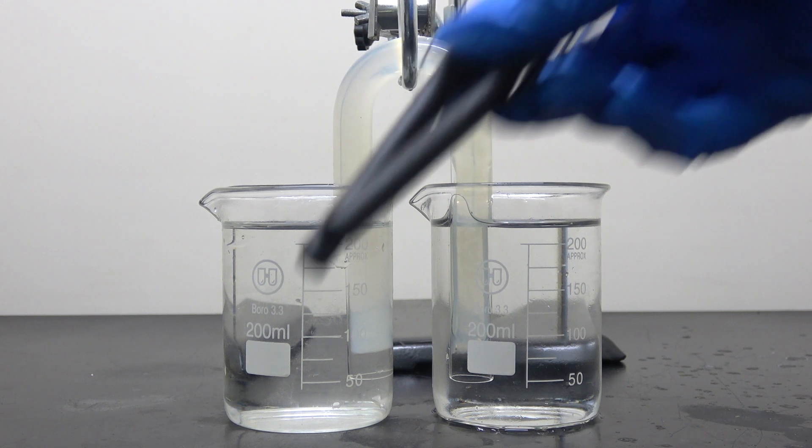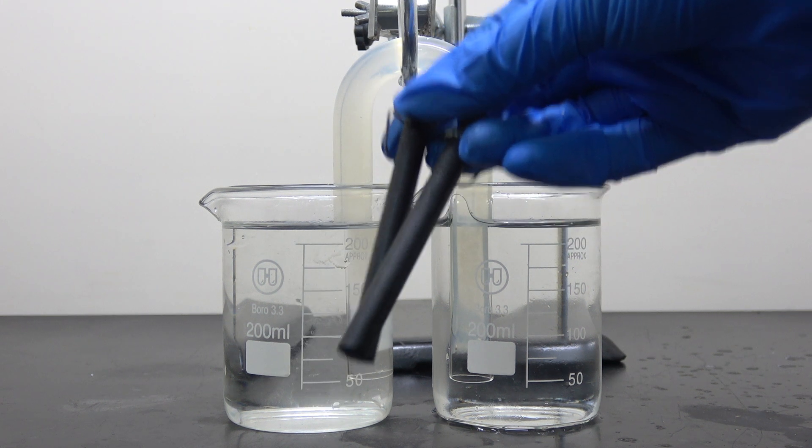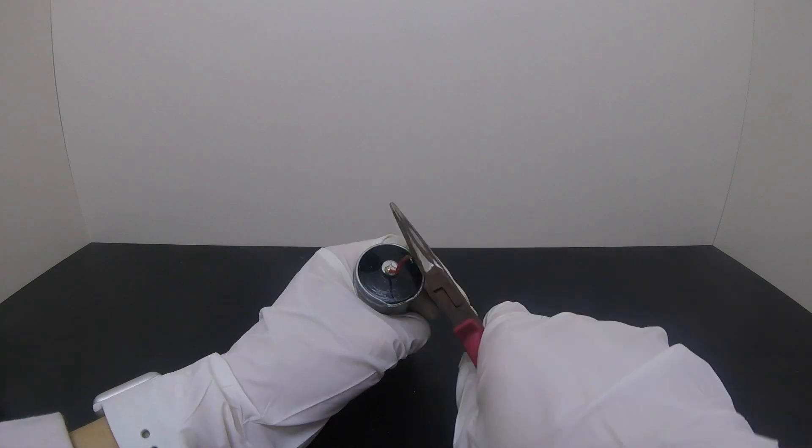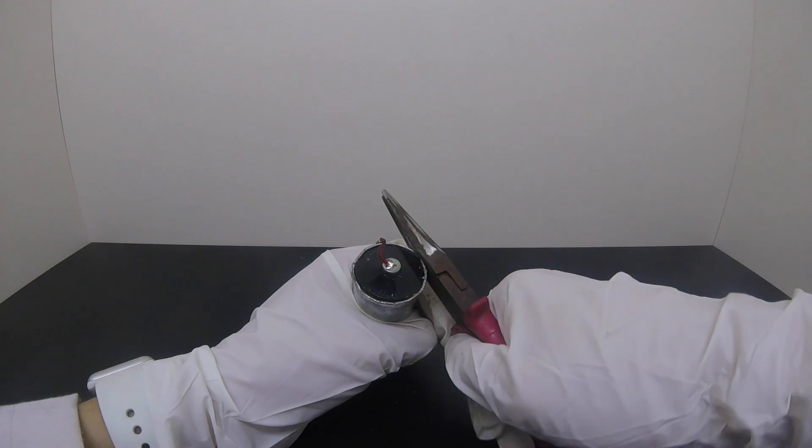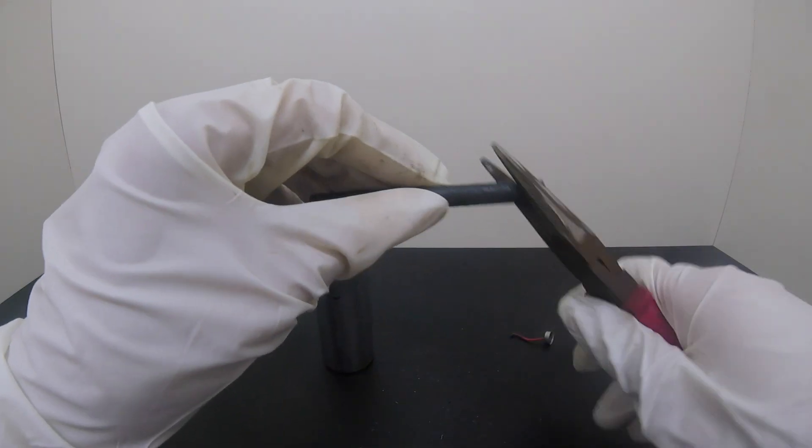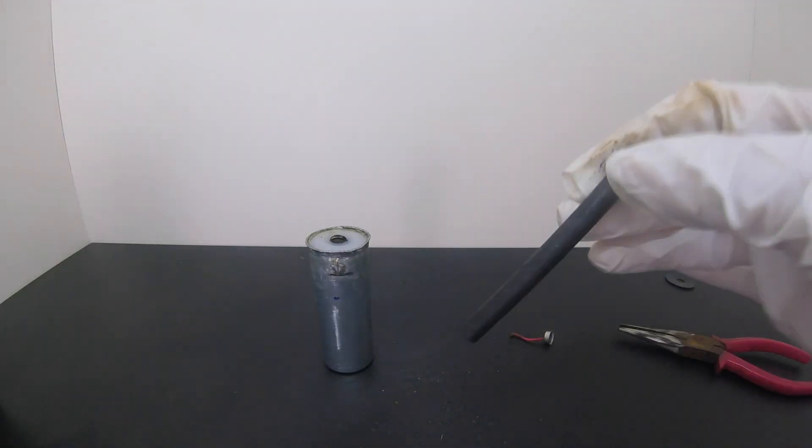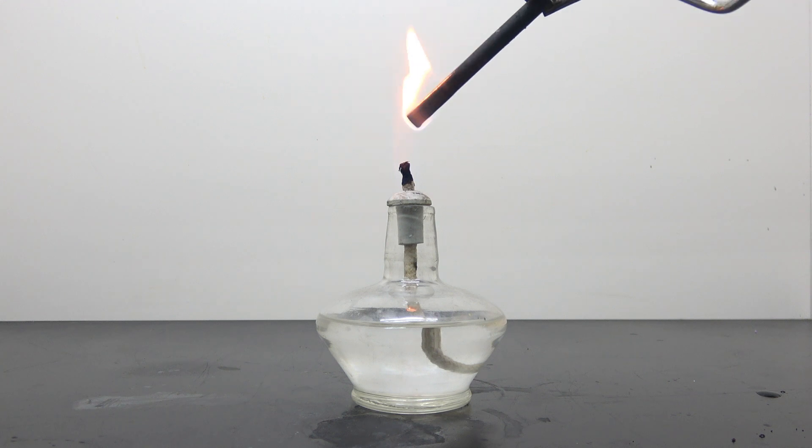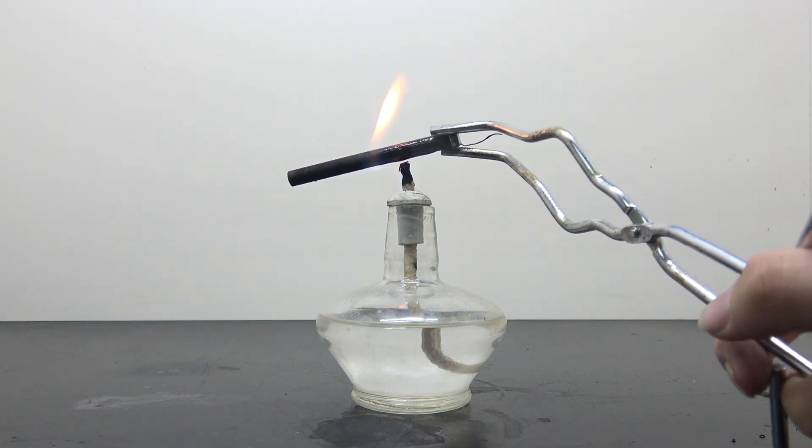Now to get two graphite electrodes, which can be easily obtained by disassembling a zinc carbon battery, as I've shown in one of my earlier videos. Be aware they are coated with some sticky organic material. To remove that, I simply put it on a lamp and let the heat do its job.